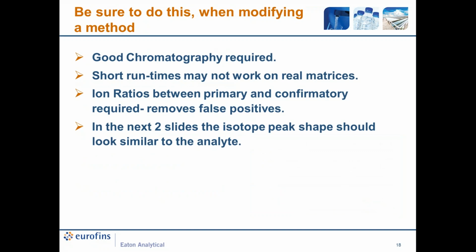Remember that LC-MS also includes liquid chromatography. It is not just mass spectrometry. All the peaks must be separated. Short-run methods may seem to work on standard solutions or reagent waters, but do they work on real matrices? The next two slides show some real data that was collected on shortened runs.